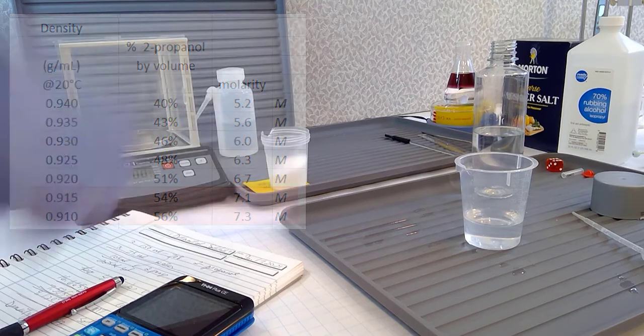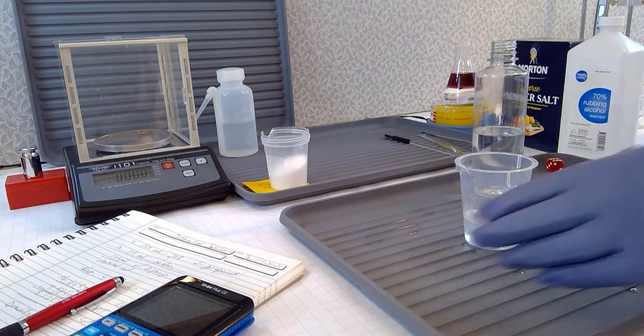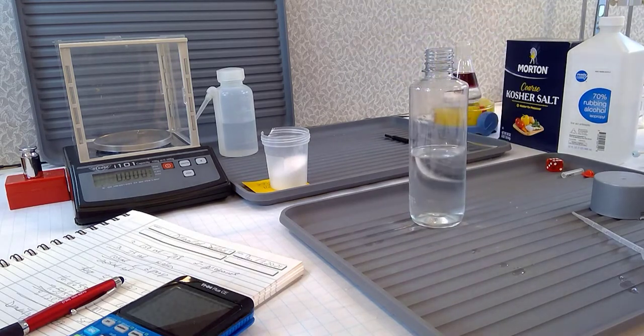And there we go. I'm not going to pour it back into the original solution. It's not really considered good practice to pour a solution back into your original. You might contaminate it. So I'm just going to leave it just like it is right now. And here I've got my solution that now we know has been diluted quite a bit.